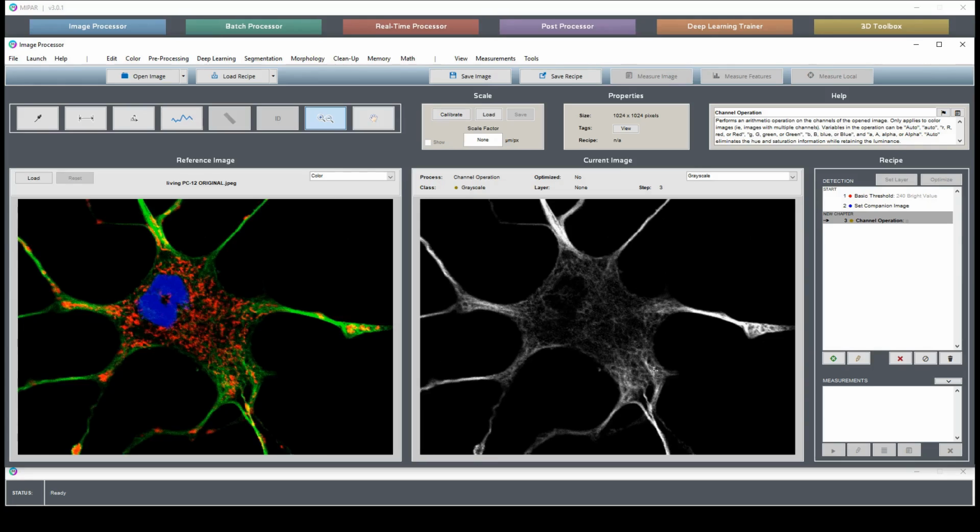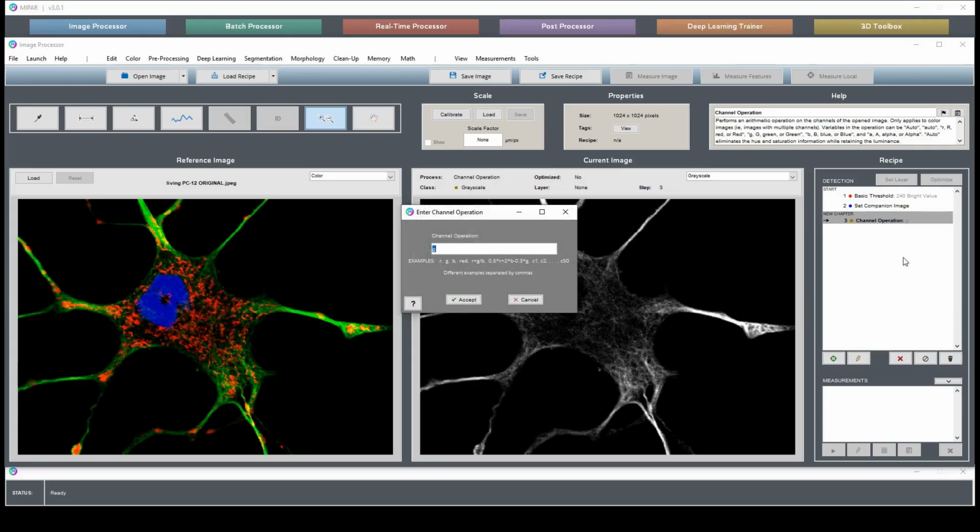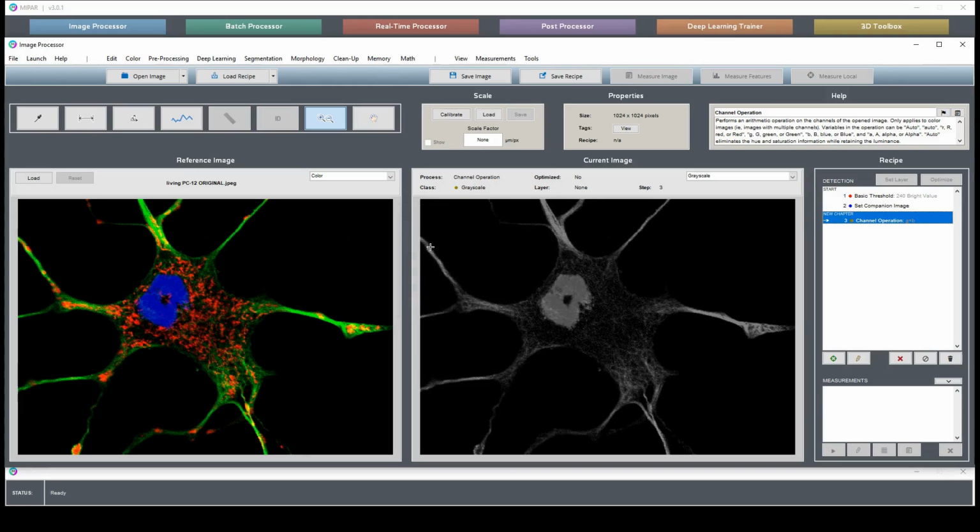Looking at the cytoskeleton, it leaves this big hole in the middle where the nucleus is supposed to be. So how about we add the blue? Now if you noticed, the screen around the outside here got a bit darker.